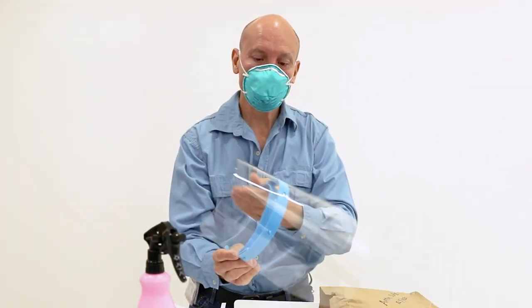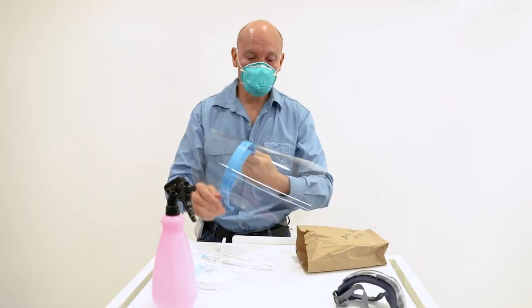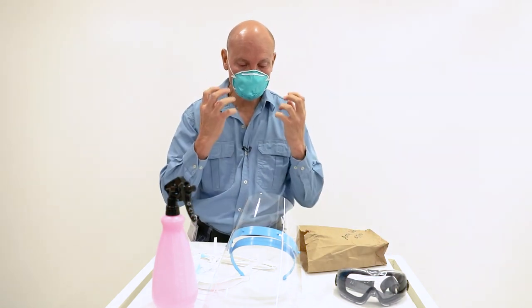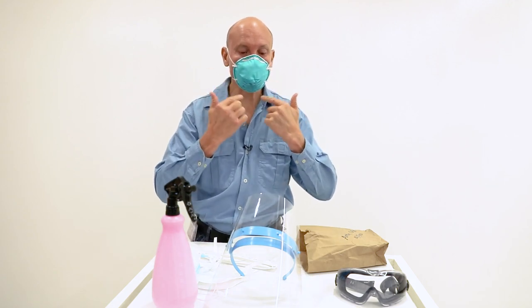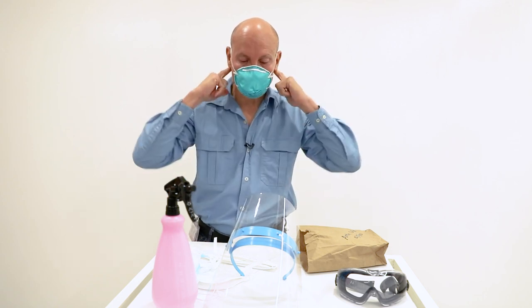The front is contaminated — whatever was around you. You can also wear other goggles underneath this. This is a way in which I do it to protect my eyes, but it is important that you have something in front. It also stops small particles from actually coming onto the respirator.